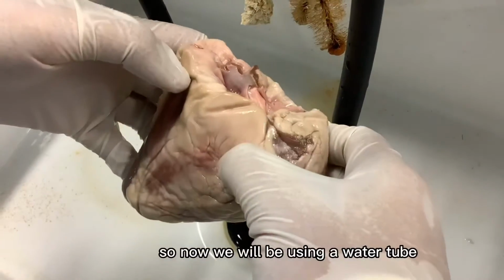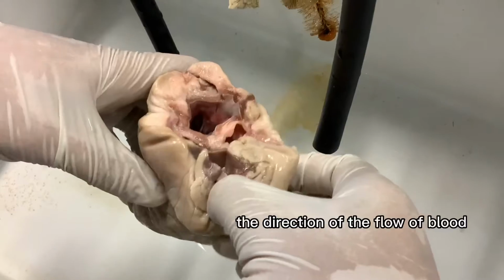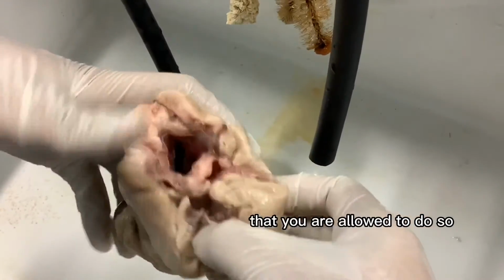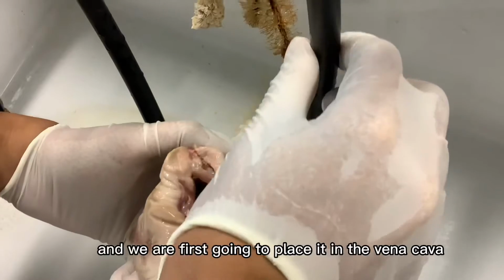Now we are going to do a water tube test, which will help us to identify the direction of the flow of blood. But before we do this, please check with your teacher that you are allowed to do so. If you have access to a water tube, take your water tube, and we are first going to place it in the vena cava.